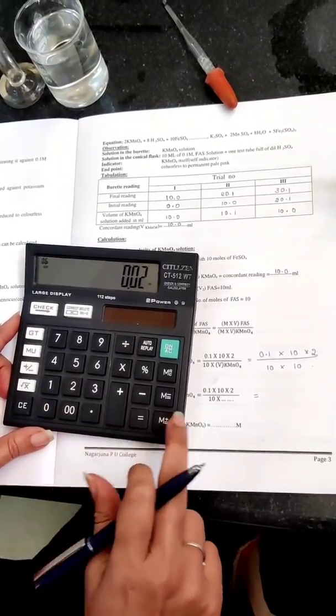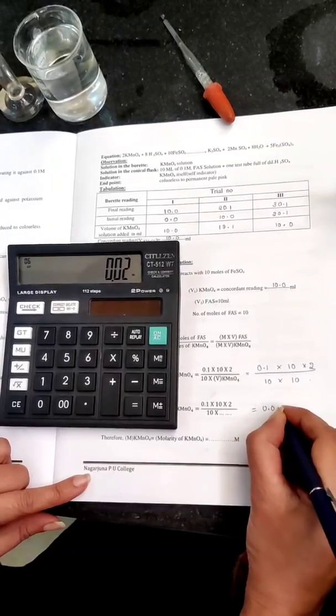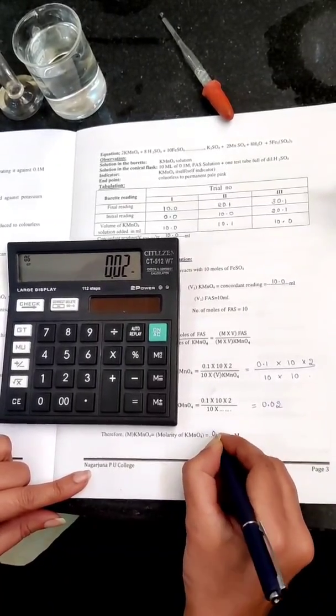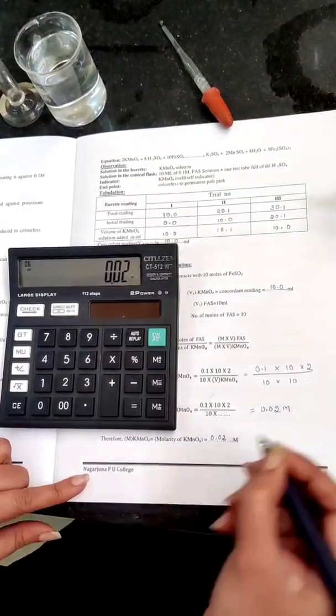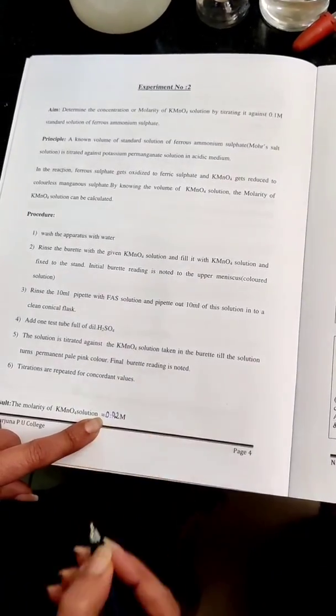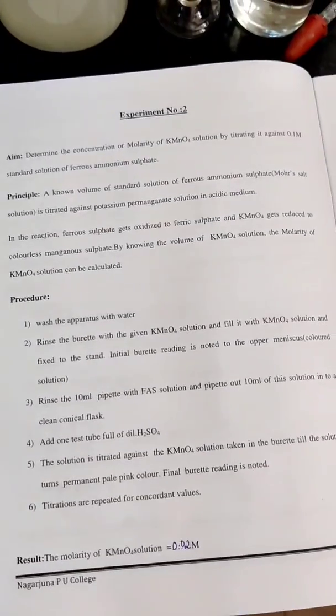That is what I am getting. You need to mention the unit. Write the final result. The molarity of KMnO4 solution equals 0.02 molar.